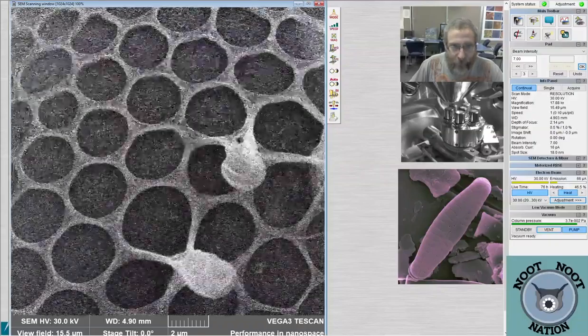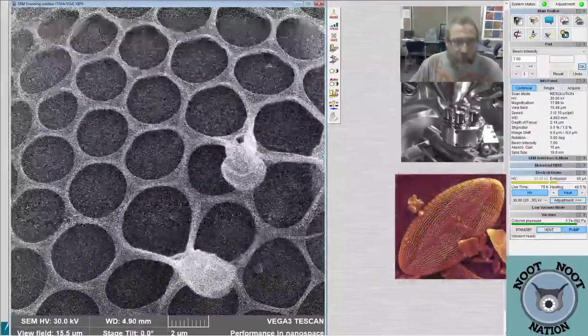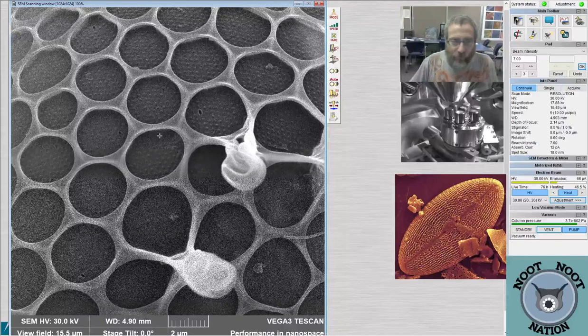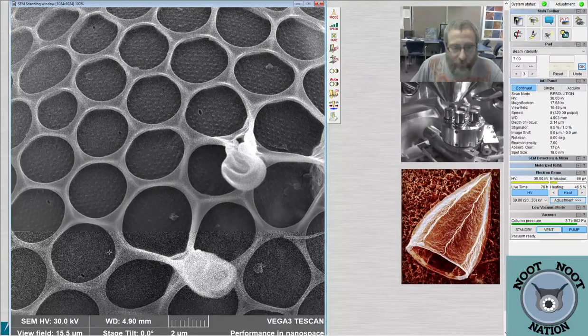If I speed up how fast the instrument's scanning, like right now, I'm at the fastest speed or the lowest resolution, it looks grainy. As I slow the speed down, you can see the beam scan slows down and the image quality improves. Each time I slow the beam scan down, the image quality improves a little bit more. This is where we took the picture. This is speed 7. I can put it on speed 8, and it will scan even slower. And the image quality difference between 7 and 8 is barely visible, probably hardly visible to you at home or wherever you are.